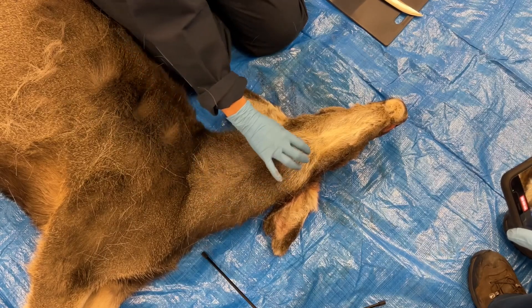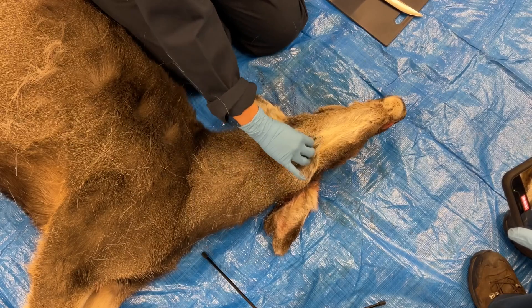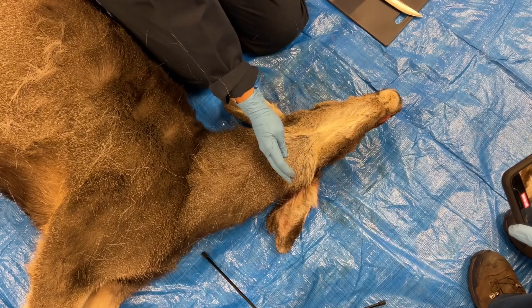First you want to identify the trachea. At the top of the trachea there is a hard piece of cartilage called the larynx. Cut at the larynx and angle back towards the skull and your tissues will be included.